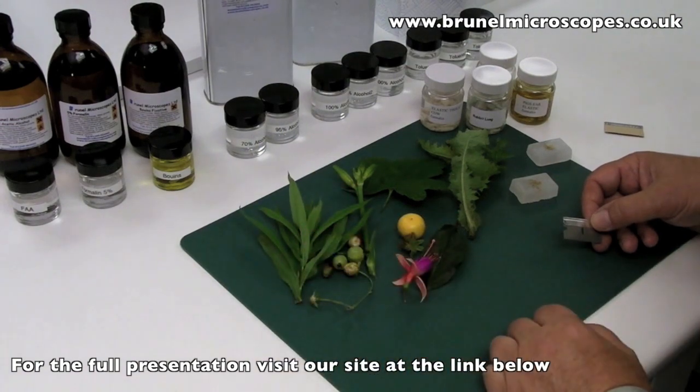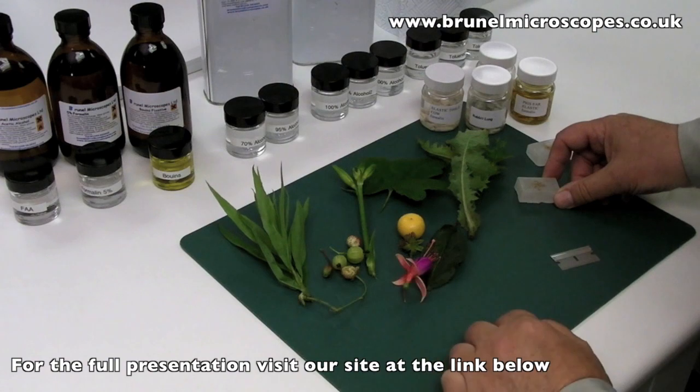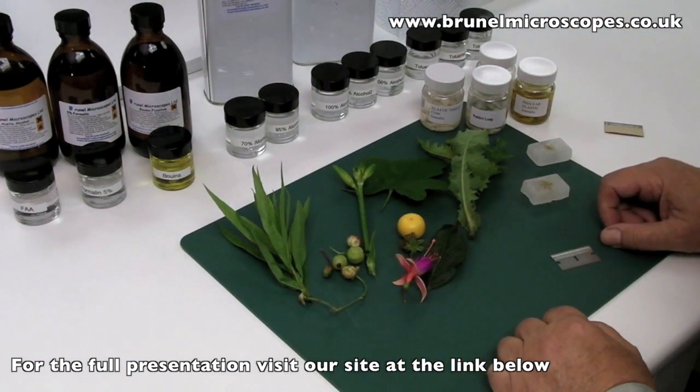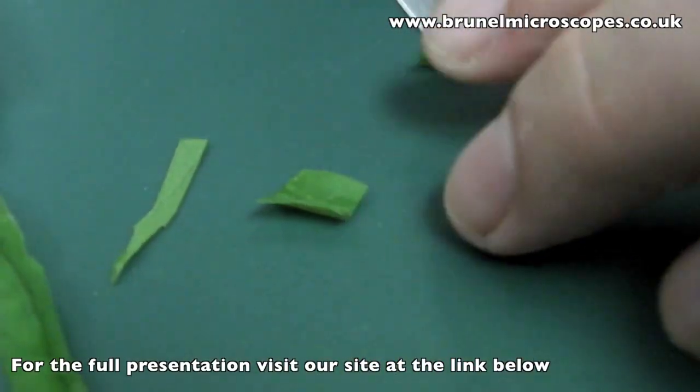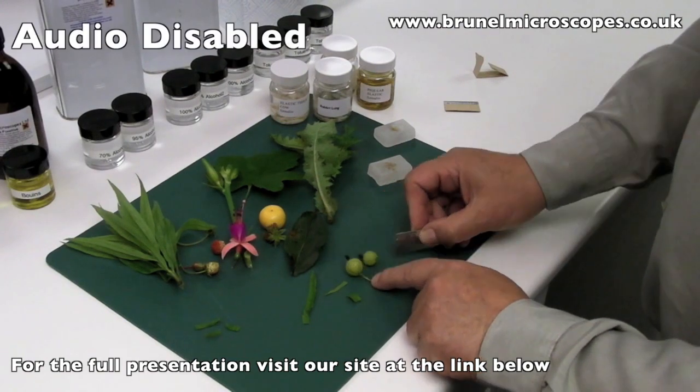In the main with botany, you are choosing stems, leaves, roots, fruits, or flowers. Do not make the pieces too thick, as they have to be penetrated by the fluids we will use. And remember, the larger the specimen, the more difficult the sectioning will be.